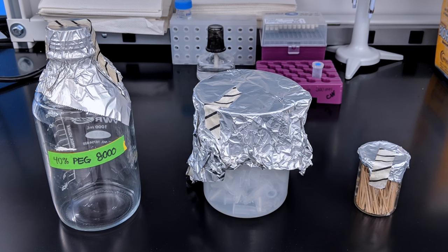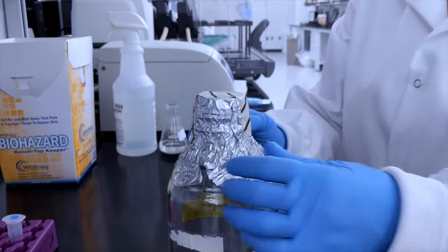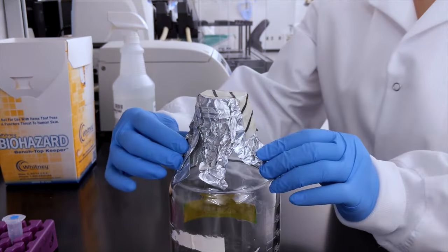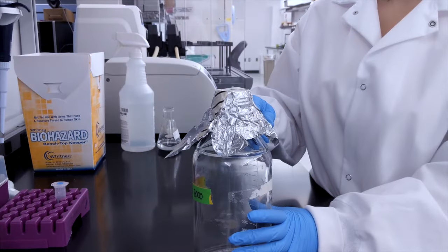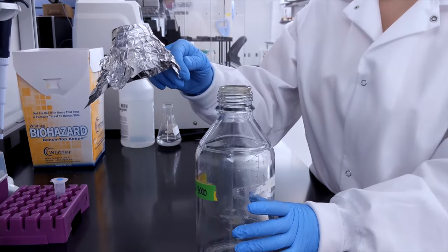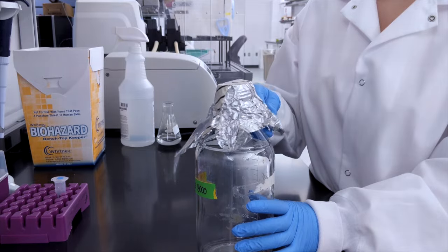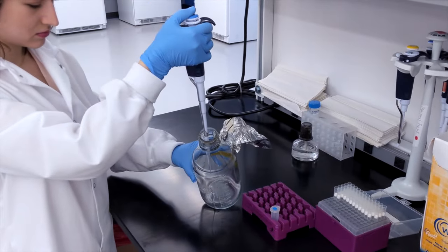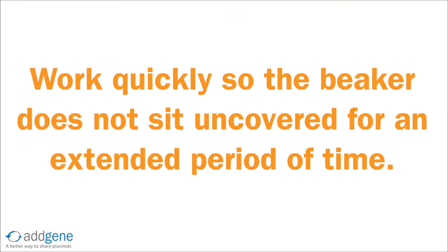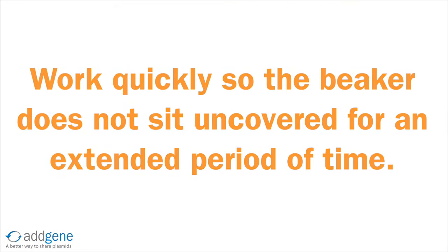Foil is often used as a cover for bottles and beakers. Before beginning your work, gently loosen the edges of the foil so that it is easier to remove. When ready, gently lift the foil with one hand and keep it upright to prevent contamination of the sterile side. While working, keep the foil in your hand rather than putting it down on the lab bench. Work quickly so that the beaker does not sit uncovered for an extended period of time.